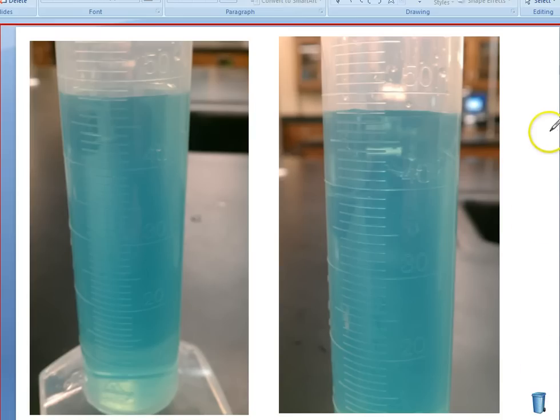Let's look at another one. Here I've got something that's measuring by tens, right? Here's 20 milliliters, 30, 40. Again, this is the same graduated cylinder, just two different pictures of it. I can tell that I have more than 40, but less than 50. Let's look at our lines to see what each line represents. I've got a bunch of lines, then a long line, then a bunch more lines.